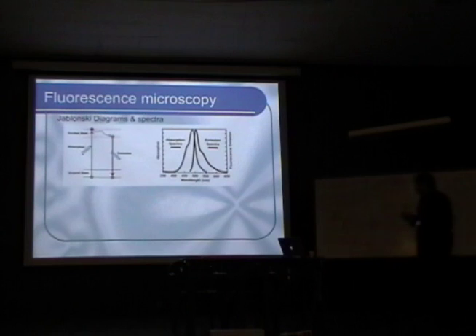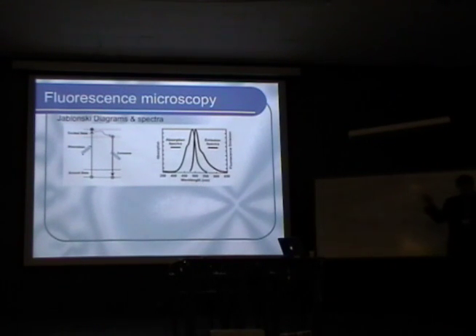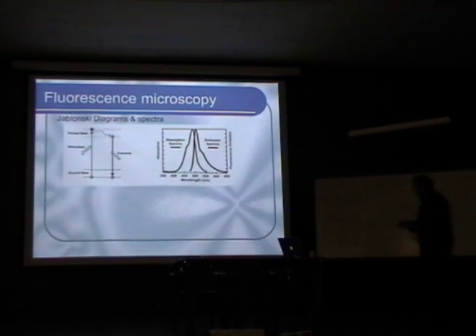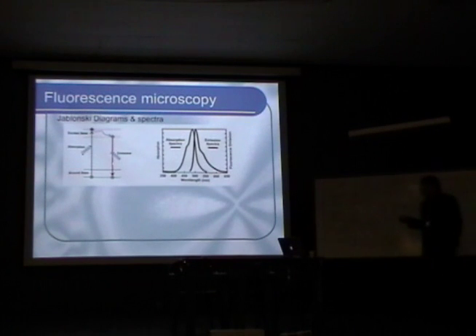The other source of contrast in optical microscopy is the fluorescence property. Fluorescence microscopy in its simplest form simply utilizes the fluorescence property of the chromophores or fluorescent dyes. So when excited at shorter wavelengths of light, by absorption of a photon at a shorter wavelength, the dye molecules typically undergo a non-radiative process, and then there is an emission at a longer wavelength of light, right?